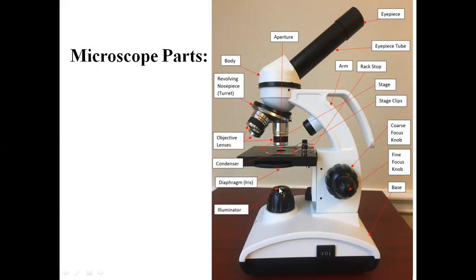So in this diagram, that mirror has been replaced by the illuminator. Most advanced microscopes nowadays use this illuminator only.